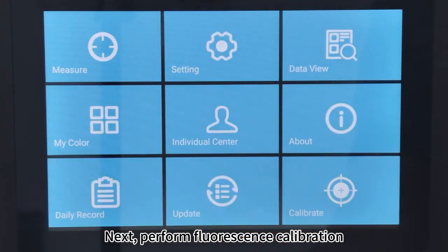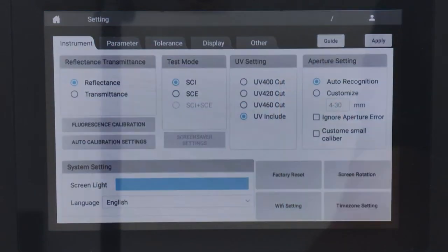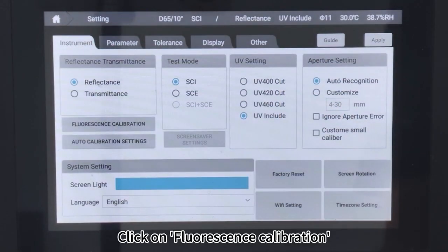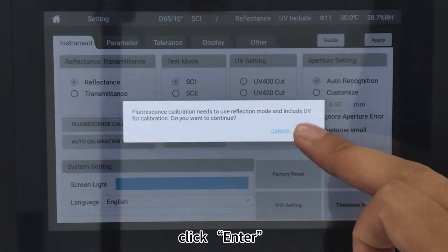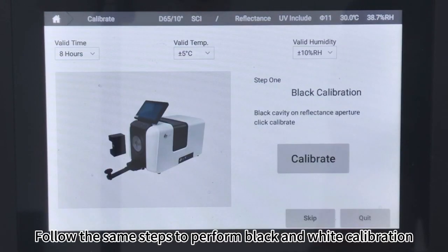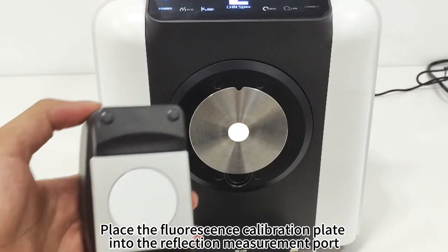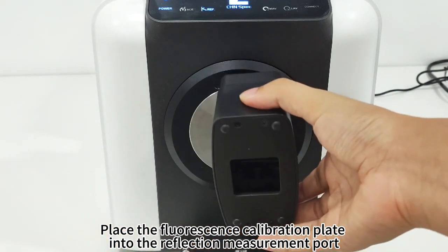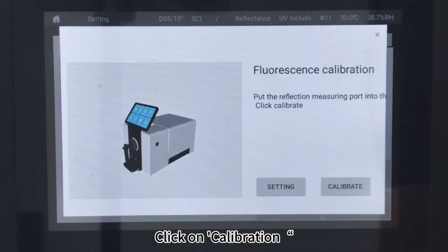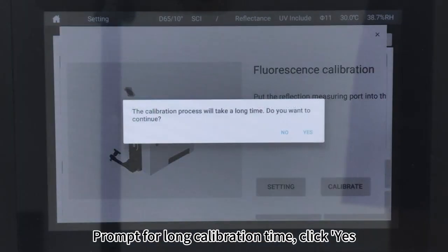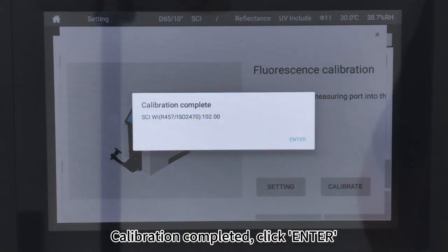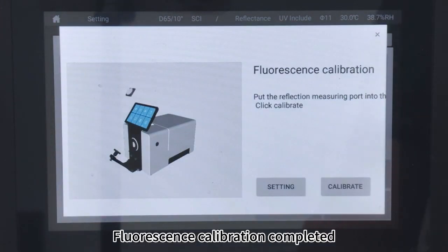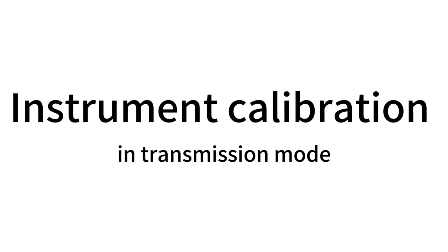Perform fluorescence calibration. Click on fluorescence calibration, then click Enter. Follow the same steps to perform black and white calibration. Place the fluorescence calibration plate into the reflection measurement part and click Calibration. When prompted for long calibration time, click Yes. Calibration completed. Click Enter. Fluorescence calibration completed.